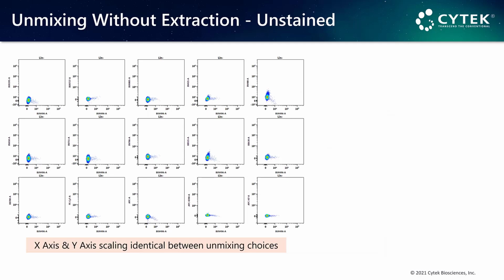When we choose standard unmixing instead of unmixing with autofluorescence extraction, the negative population looks neat and round, and we simply see a little autofluorescence spread into the BUV496 positive channel instead. In this panel, the antigen conjugated to the BUV496 is CD45.1. This is a very bright and well-resolved antigen, and if we had chosen a less abundant antigen, for example, CD25, the spread from the negative into BUV496 might compromise our ability to resolve that BUV496 positivity.